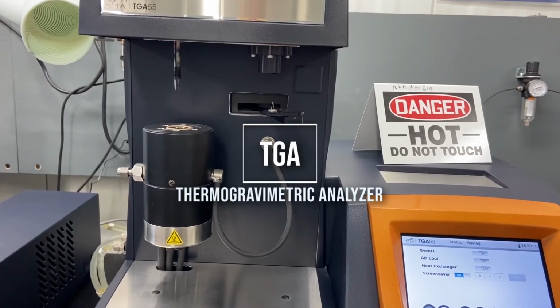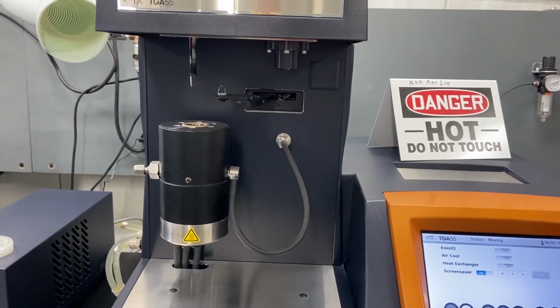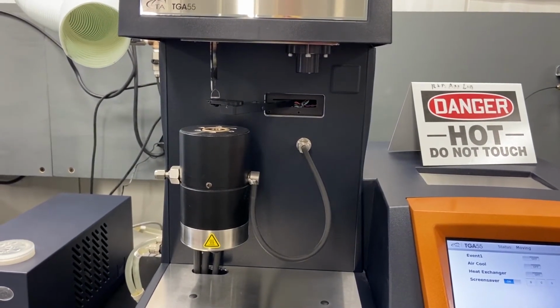The Thermogravimetric Analyzer, or TGA, monitors sample mass as a function of time and temperature. The sample can be run in either air or nitrogen.